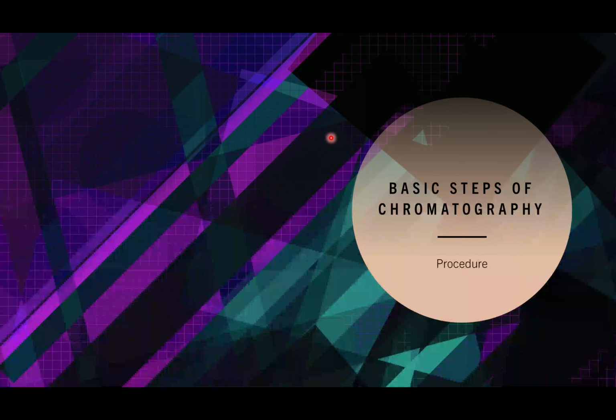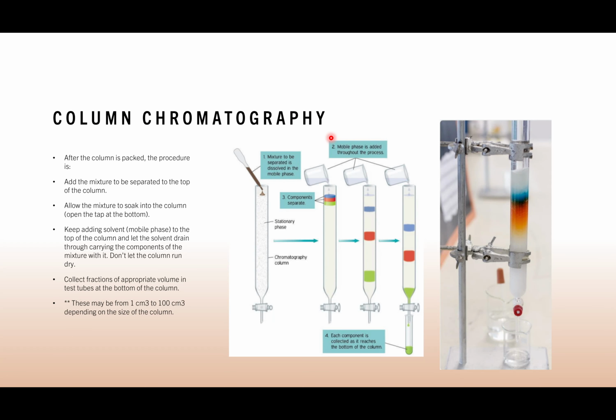All right, so let's have a look at this now. Basic steps of chromatography, the procedures. Column chromatography: after the column is packed, we add the mixture to be separated to the top of the column, then allow the mixture to soak into the column. Keep adding the solvent, or the mobile phase, to the top of the column. Do not let the stationary phase become dry. Always keep the mobile phase there. Don't let it run dry at all, it will affect the experiment.